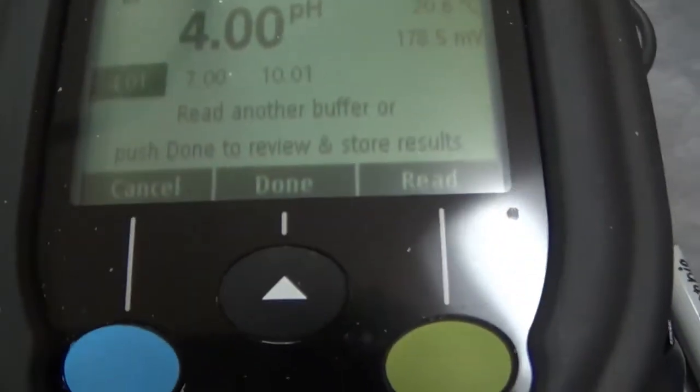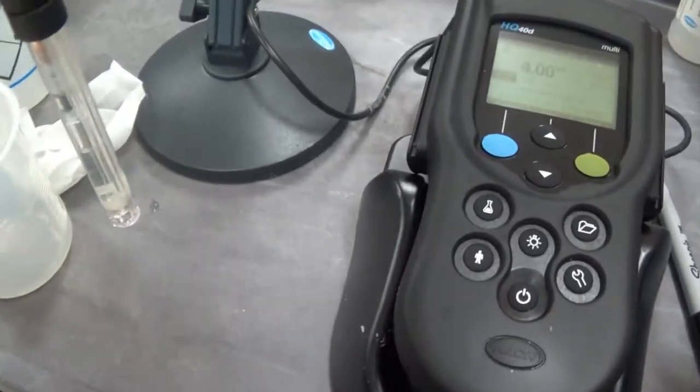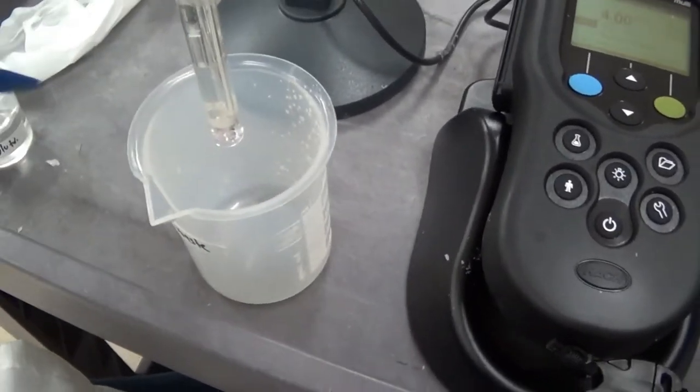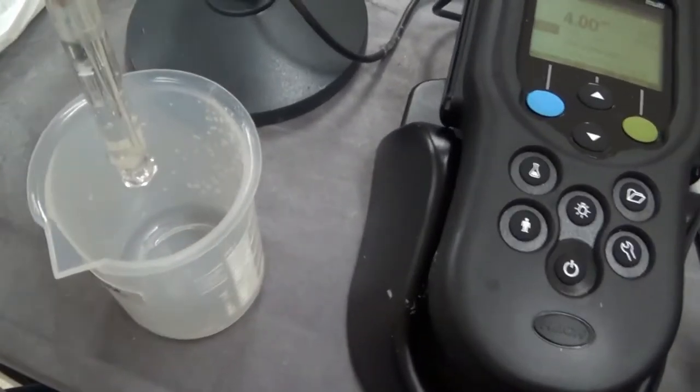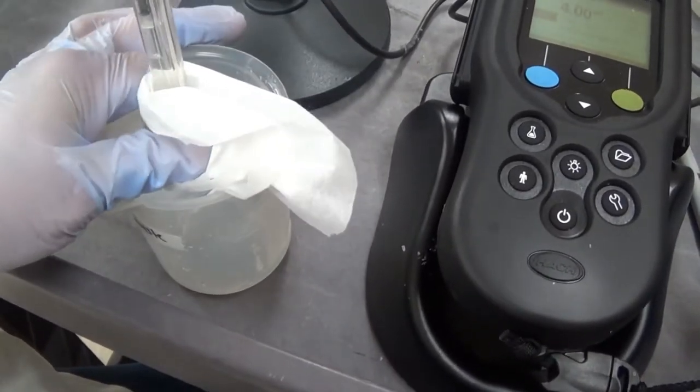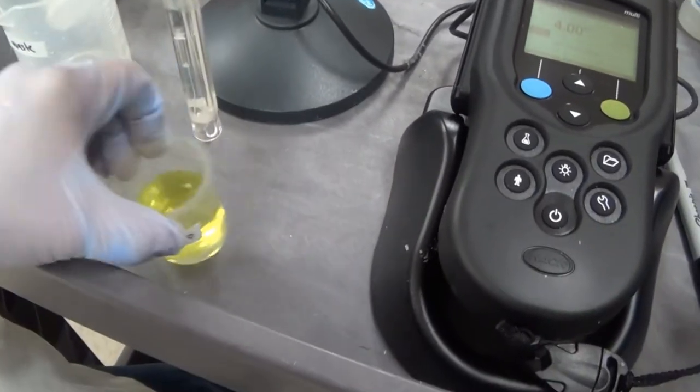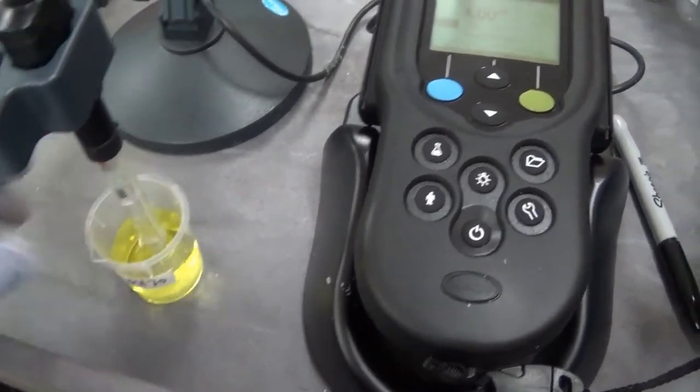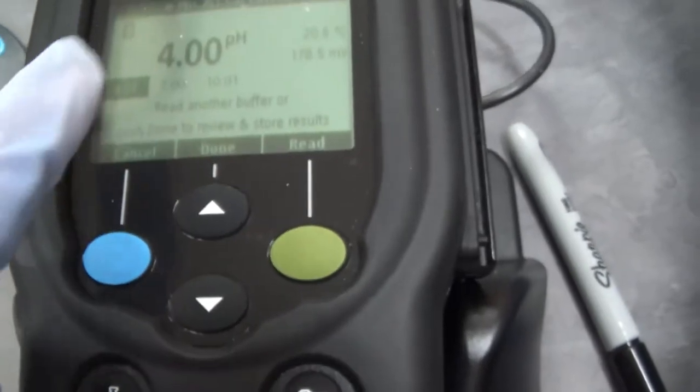Read another buffer or push done to review and store results. We are going to do all the buffers so we can have the entire pH range ready to go. If we were only going to do a pH of 4 and pH of 7, we would want to have only acidic test samples. But we are going to be prepared for all of them.